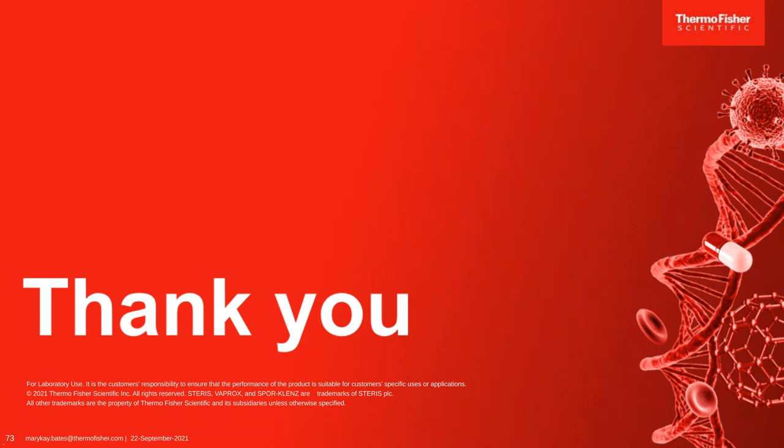That's great. Thank you, Mary Kay. Let's see, next question. Thank you for your information on disinfectants. I see that you say 1 to 3% hydrogen peroxide as a manual disinfectant is okay. What about 6%? Would that be okay also?